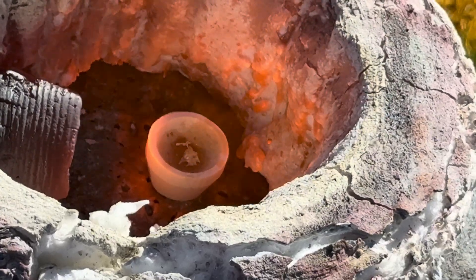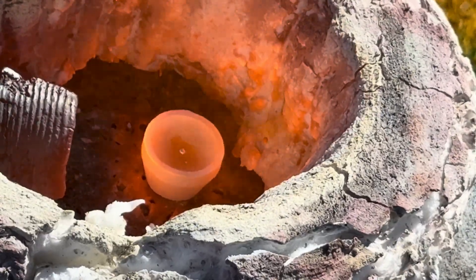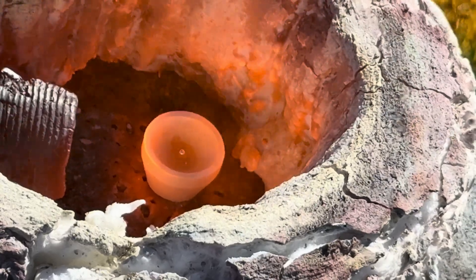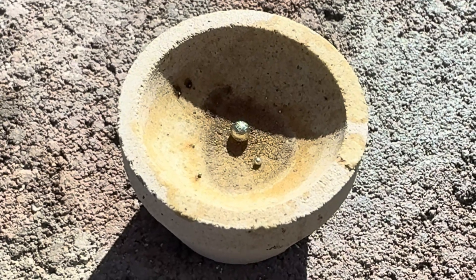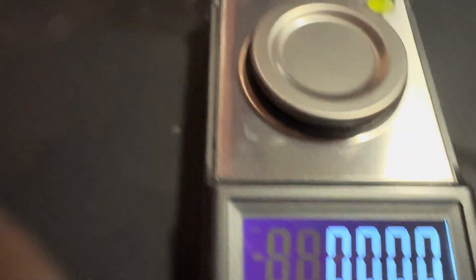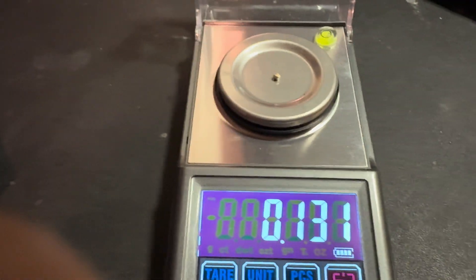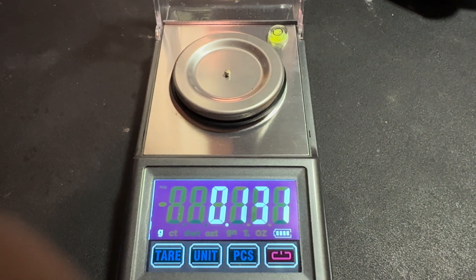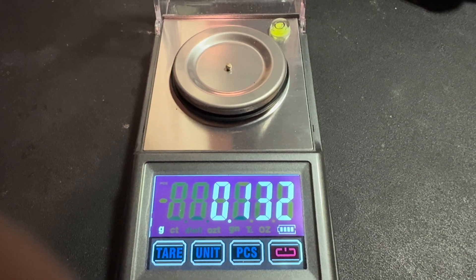We have our gold inside the furnace cooking — let's see what is going to happen. Here is our Gold Canyon gold and we got actually two little beads. The little bead weighs 0.007, and our larger bead weighs 0.131 of a gram. So both beads together weigh 0.138 of a gram from Gold Canyon.